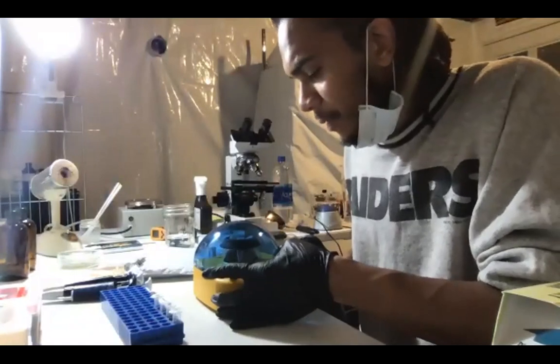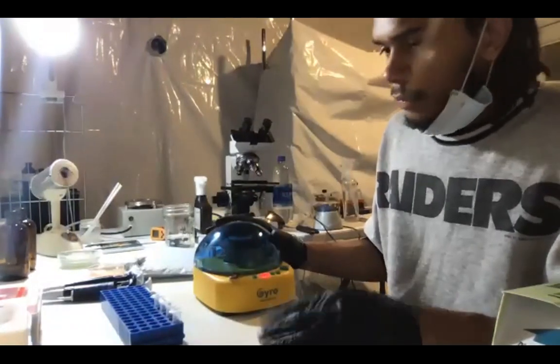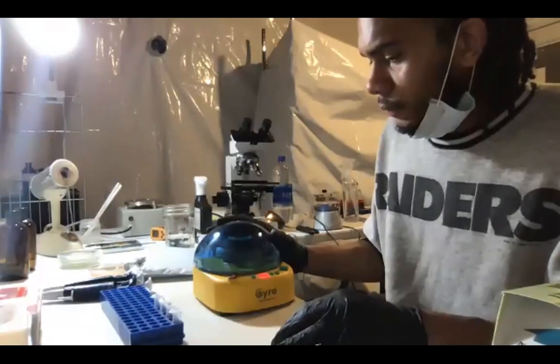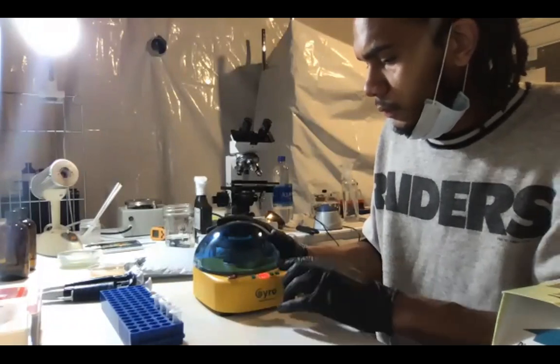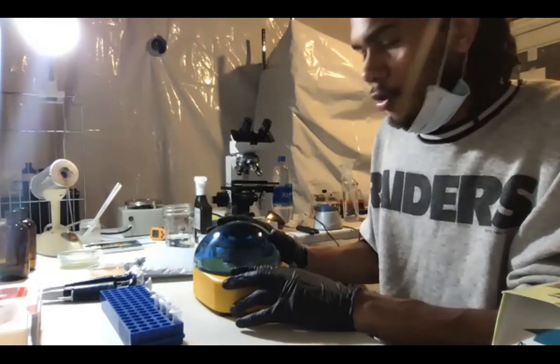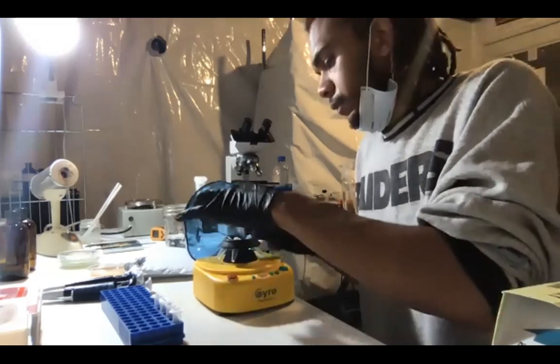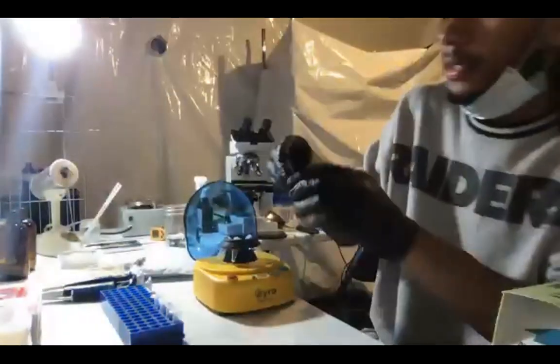I'm going to turn this to top speed and literally just turn it on for like 20 seconds. That'll force everything to the bottom. Now there's nothing on the sides anymore. Everything's on the bottom. It's literally just a tiny bit of liquid. That's all you need.